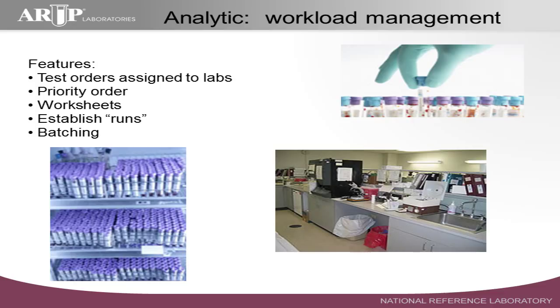There's a lot of volume, like you see all those purple top tubes, and we have to be able to deal with that volume. And those functions are built into your typical LIS. So for example, all the tests you set up in your LIS are assigned to a laboratory section. That's where the analysis is done. That lab section is responsible for that testing.